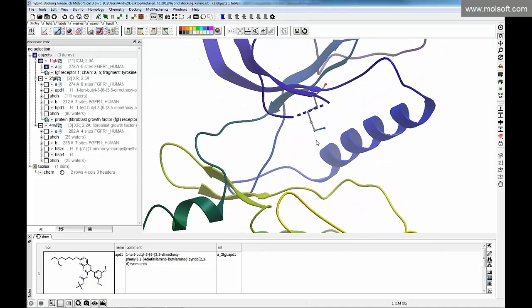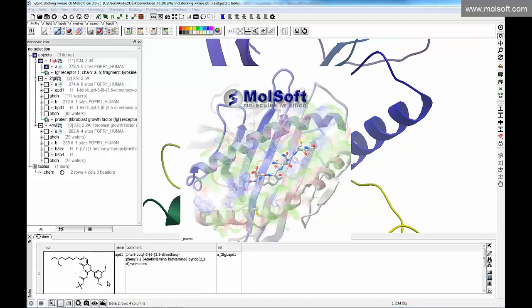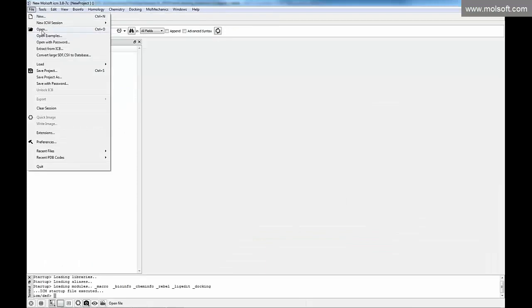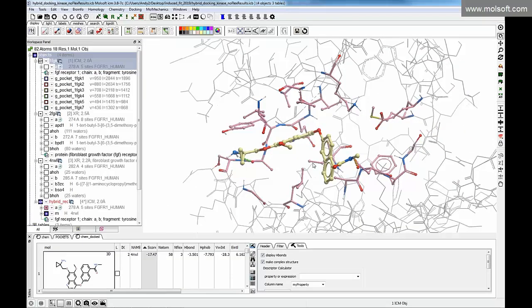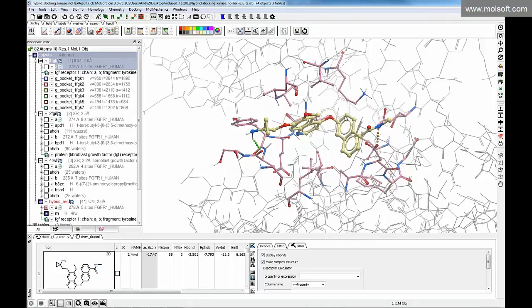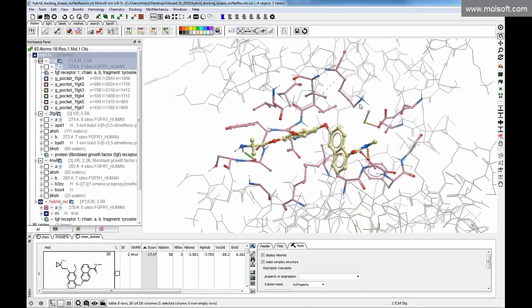We have a number of inhibitors here. If you dock with just regular docking, there's no way that these inhibitors are going to be able to bind correctly. They get blocked by the lysine, and the scores are pretty low for this structure, -17, -12. So you need to allow some flexibility of this lysine.